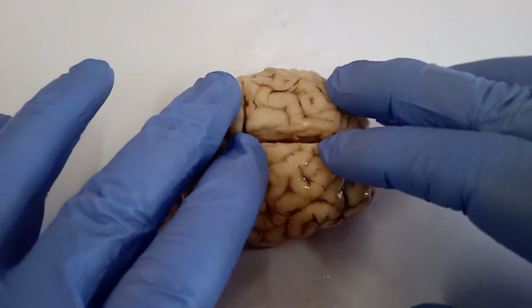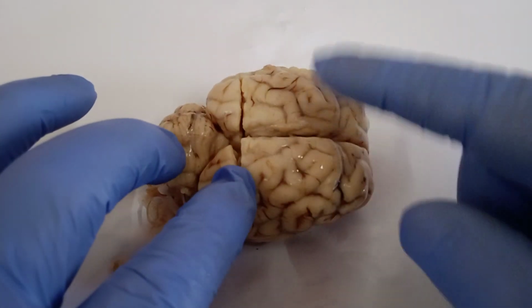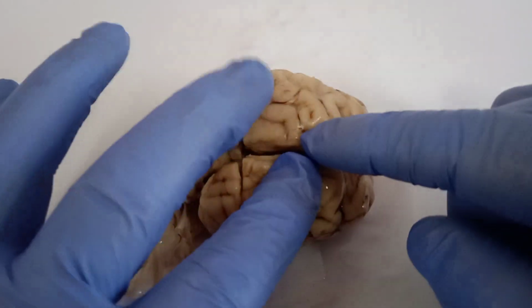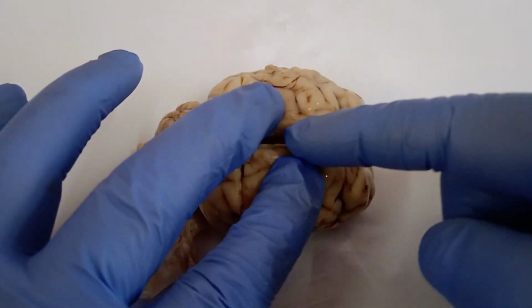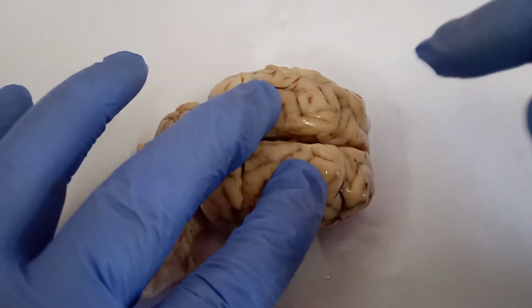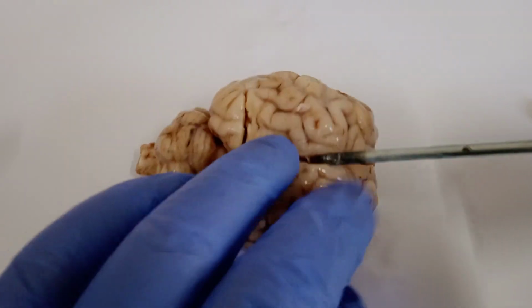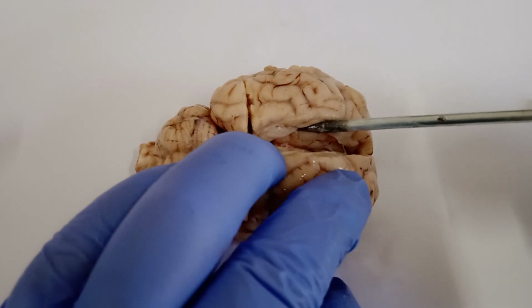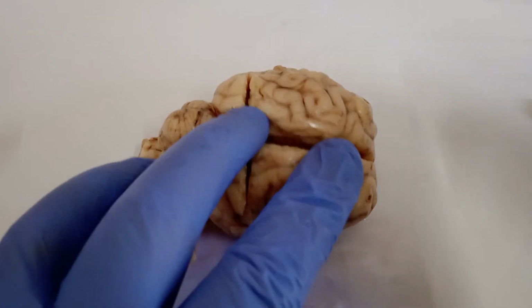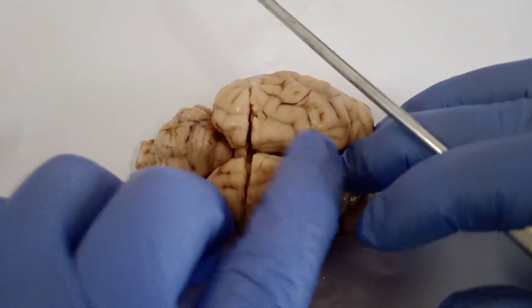Now there is a third type of fiber that connects the two cerebral hemispheres, and those are called commissural fibers. One of the best examples of commissural fibers is the group of fibers connecting these two cerebral hemispheres here inside this deep longitudinal groove, and the example is the corpus callosum. Let us see if you can see the corpus callosum here. It will be white in color. While separating these two cerebral hemispheres, we have to cut the corpus callosum.